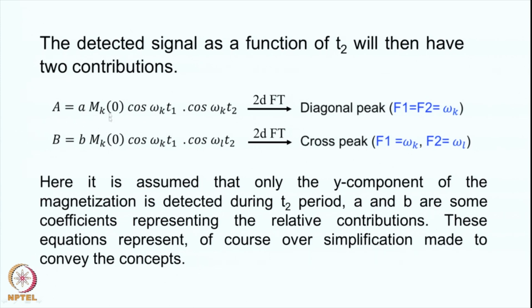So, there will be some magnetization which remains on the spin K and some magnetization will be on spin L. And the components which are present there are represented by these coefficients A and B. A is the component which remains on spin K itself, and B is the component which gets transferred to the spin L. Now during the period T2, what happens? This magnetization continues to evolve with its own characteristic frequency omega k, right. So this is omega k, because it is the k magnetization. So during T2 also it goes with the same frequency omega k.